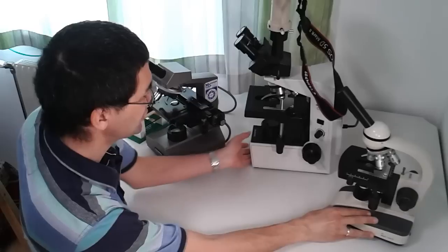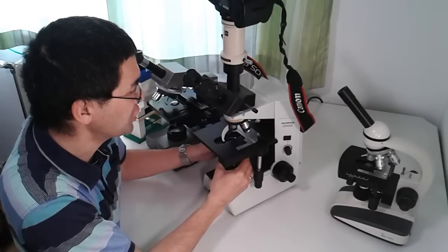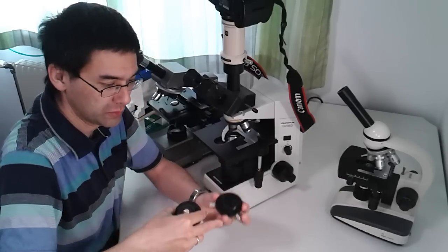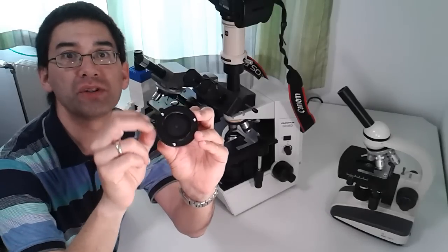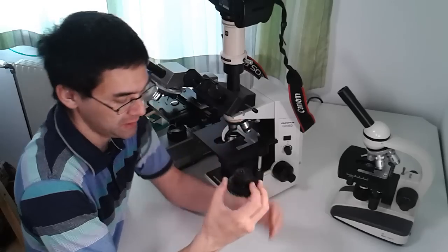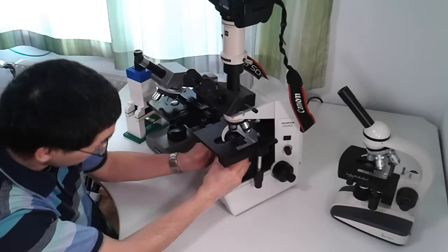Third, all three have a condenser. I'll take the condenser out of this microscope — you lower it and unscrew it. Between the lamp and the objective there is this optical system, the condenser, which really improves image quality. It has a diaphragm that opens and closes — the condenser aperture diaphragm — which is used not primarily to control light intensity but to control resolution, contrast, and depth of field. I recommend having this feature. Very low-cost microscopes don't have it.